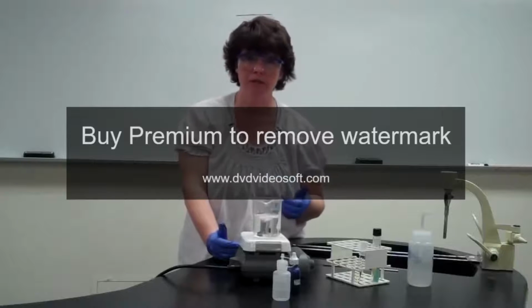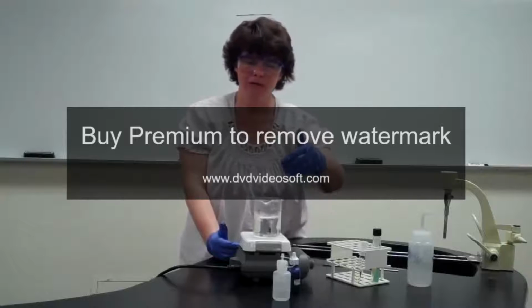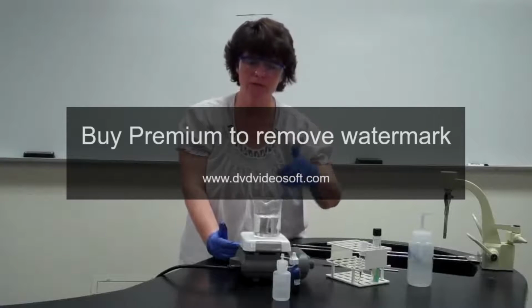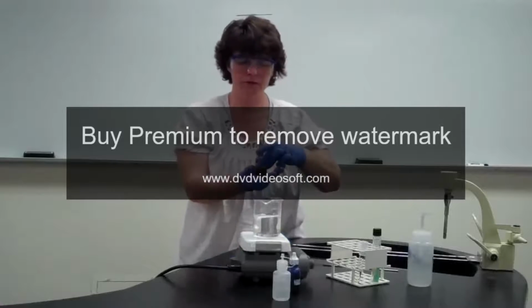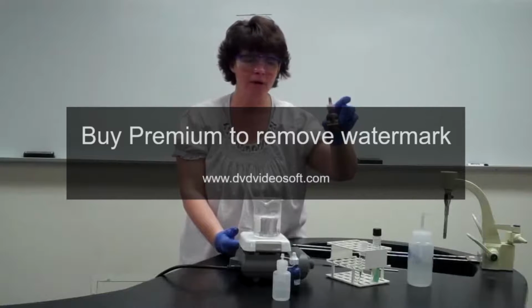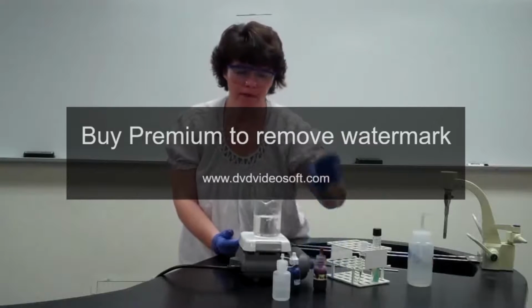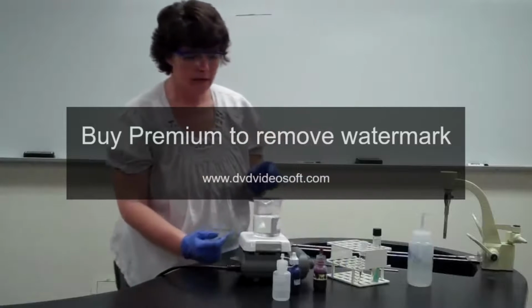So that's the first change we're making. We're going to actually put the slide on the boiling water bath to steam it so that it allows the carbol fuchsin to penetrate the wall. So that being said, our first stain in the acid fast is the carbol fuchsin. So now you're noticing we're using a red stain as our primary stain as opposed to the purple one of the gram stain.